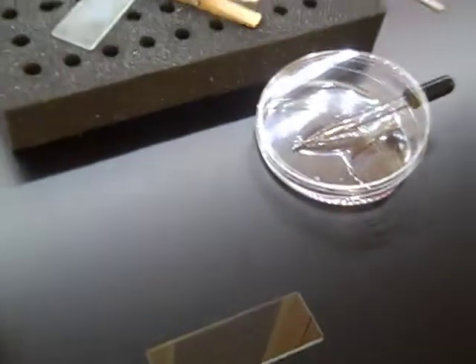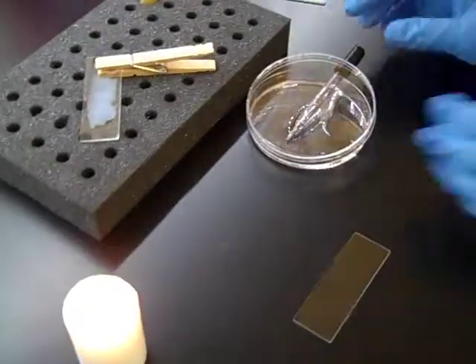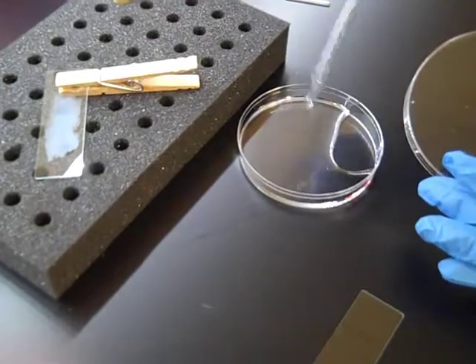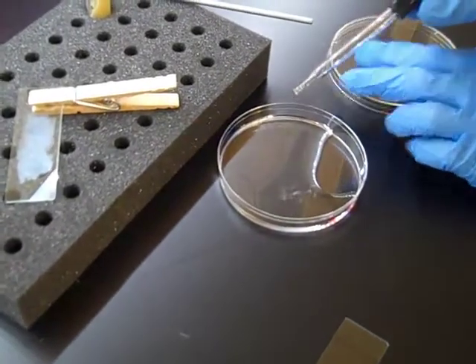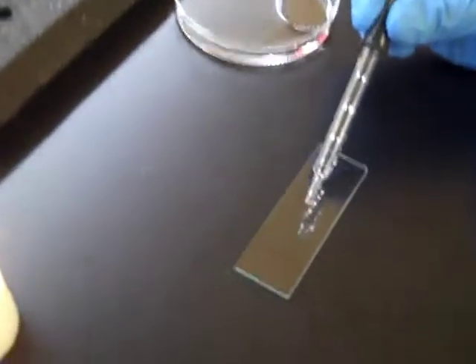This video will show you how to prepare a bacterial smear. First, you're going to want to put some distilled water in a petri plate so you can easily use it for this and the gram staining procedure. Using your dropper, place a small drop of water on your slide. It needs to be small because you want it to dry in a normal amount of time, so that size is plenty.